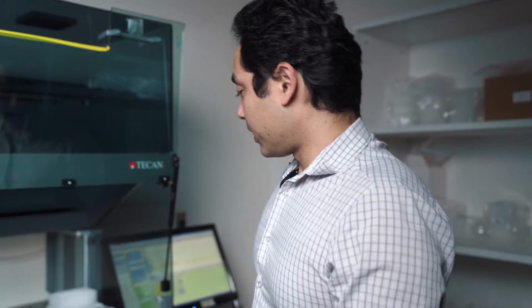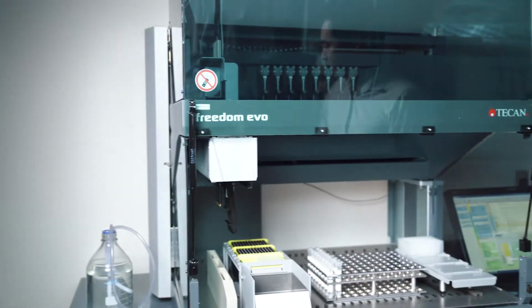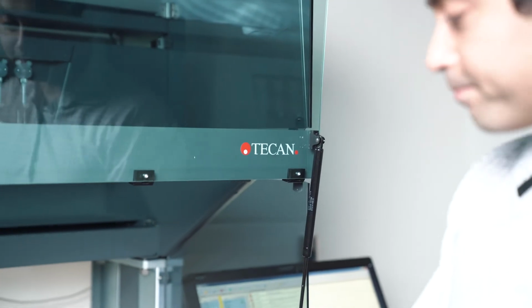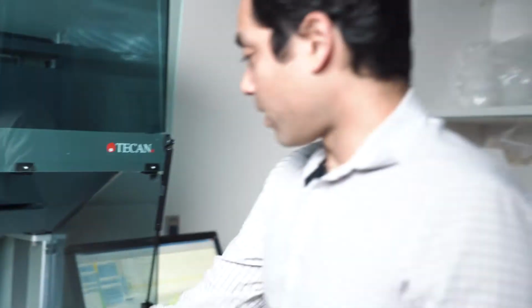And this is a Tecan Evo. This is one of the instruments that I have. You can use a Hamilton or other liquid handlers, but the idea is the same. What you want to do for a tube to plate, and why these units are good, is it has a span 8 head. So that's what you're looking for.